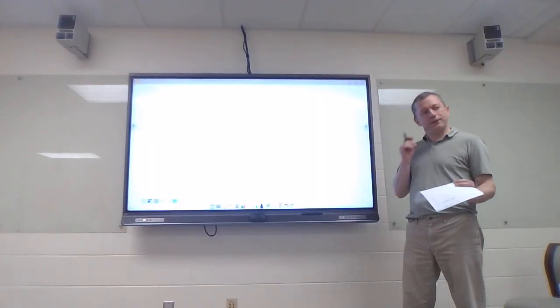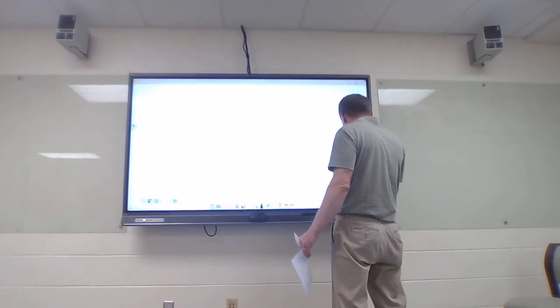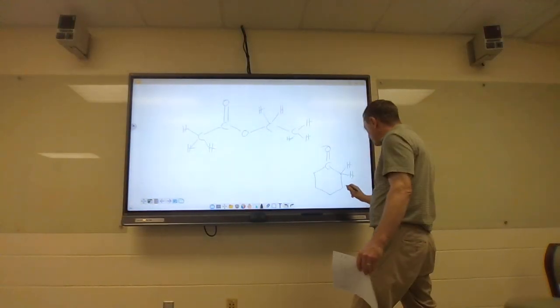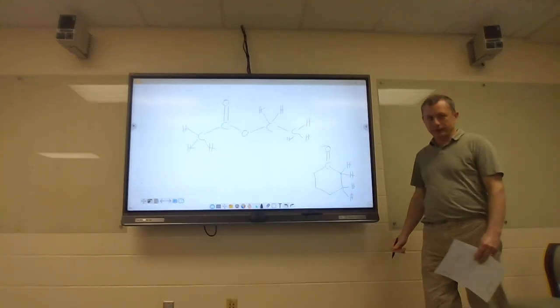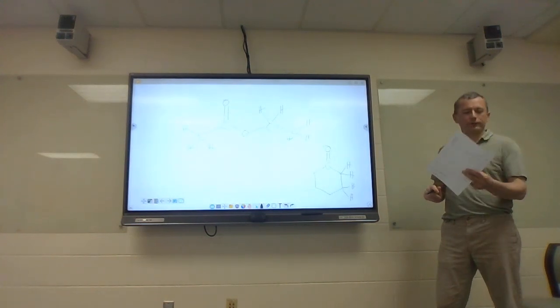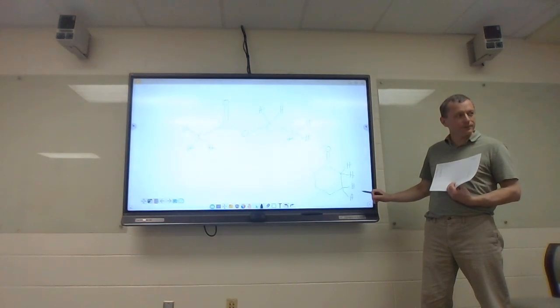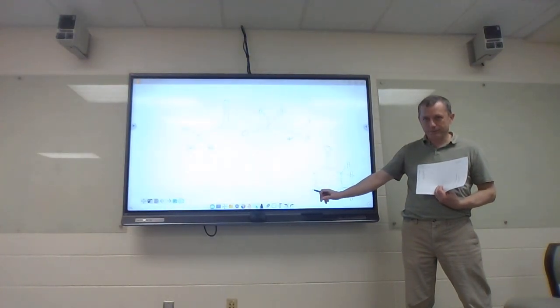And now that one, if you look at the 2 hydrogens there, they're next to a carbon with 2 hydrogens, and it does actually look like a triplet. It fails when we go beyond it. Now, looking at these 2 hydrogens, they're identical to those 2 hydrogens.